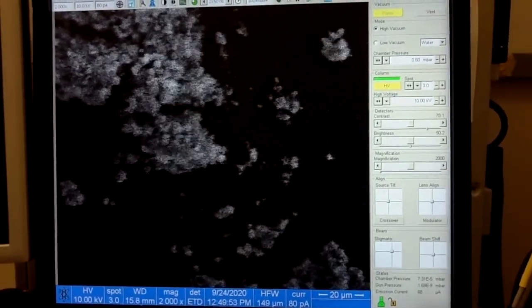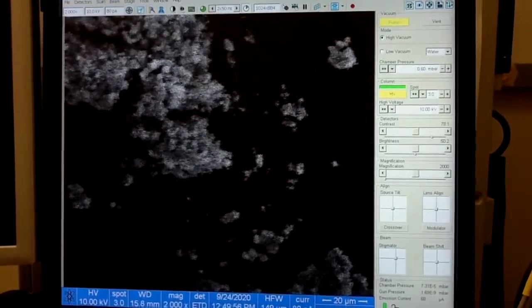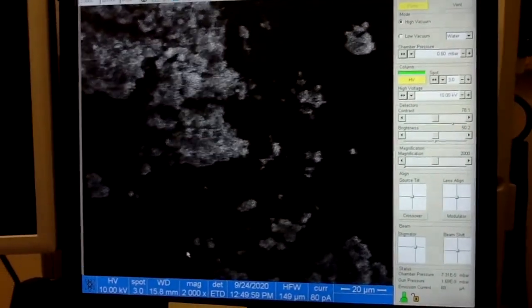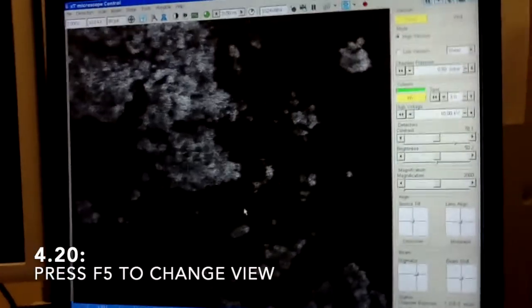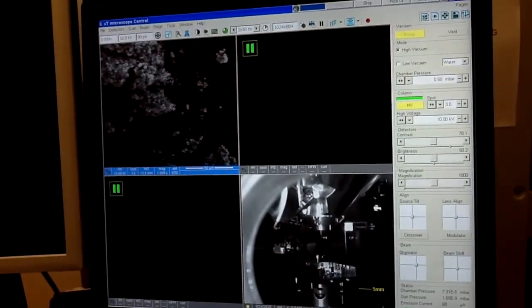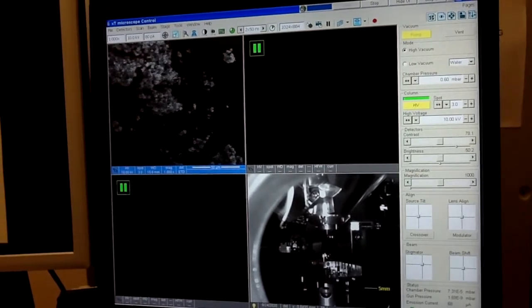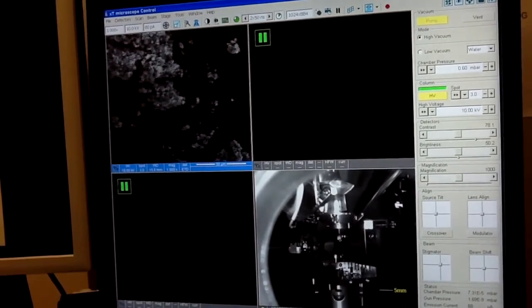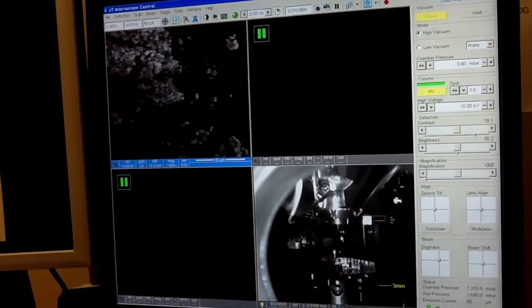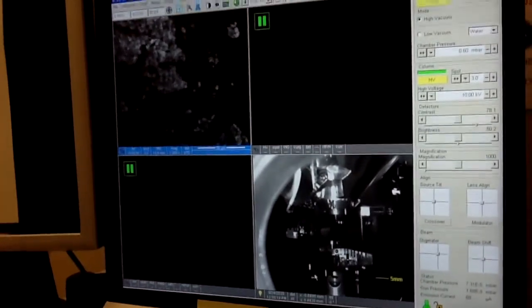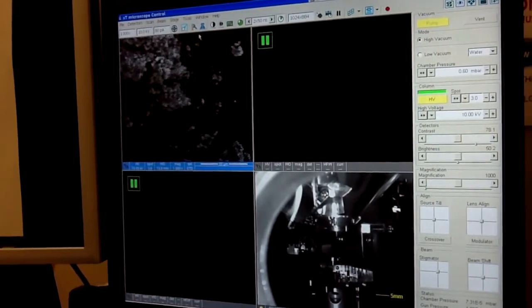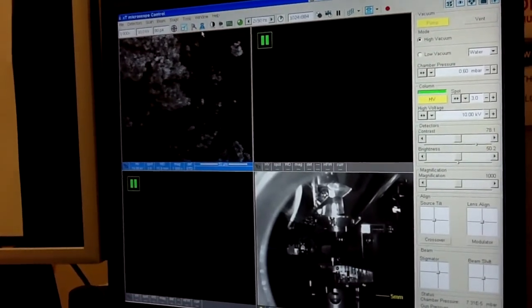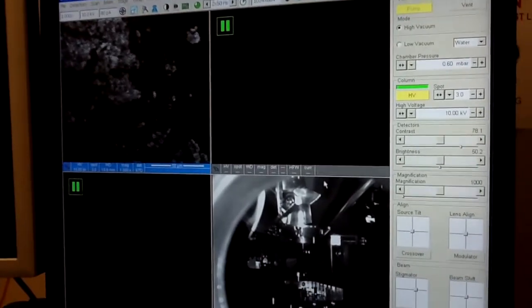And this is really far away from the optimal working distance. Optimal working distance should be 5 millimeters, which means we need to move our sample up by 10.8 millimeters. To do this, press again F5 button and have a good view on the chamber because you don't want to hit your sample against the pole piece. So it's always good to check what's going on with the sample.